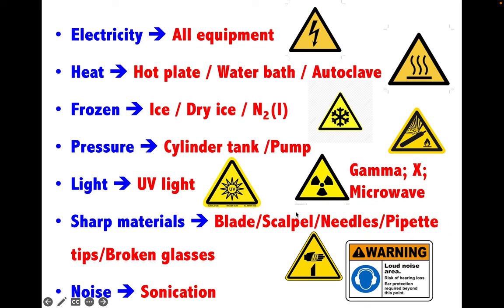There are many electrical equipment items operating in the laboratory; electricity hazard symbols must be placed on all such equipment. Heat generated from hot plates, water baths, and autoclaves must also be warned about at all times. Frozen hazards include dry ice, liquid nitrogen, and even ice. Pressure equipment includes cylinder tanks of oxygen and carbon dioxide, and pumps. Light sources such as UV lamps, gamma ray, X-ray and even microwave. Sharp materials like blades, scalpels, needles, tips and even broken glass. And noise from sonication must be marked with the corresponding symbols.